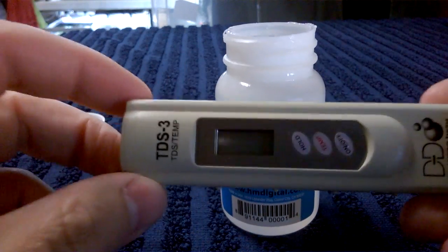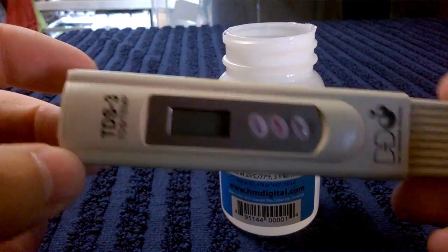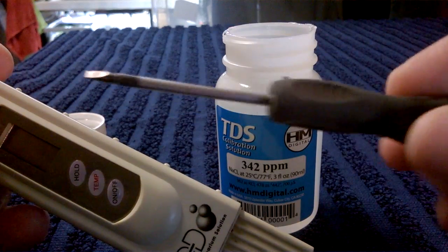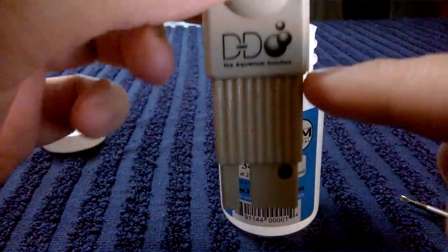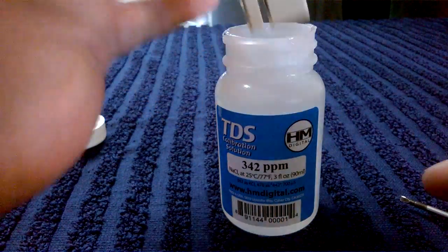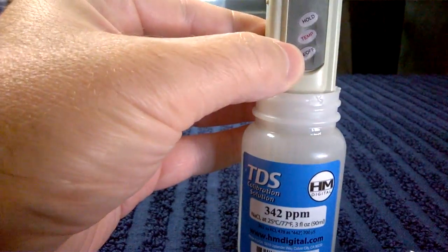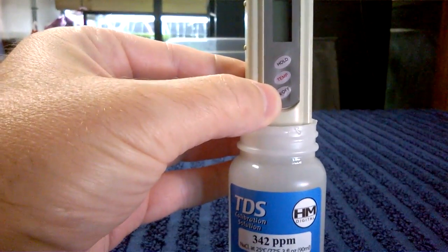This is my standard TDS meter — probably the same one a lot of you have. Very simple. You will need a small slot-headed screwdriver for the back. All you do is put it into the fluid up to the normal mark where you normally measure TDS in your water — in like so.